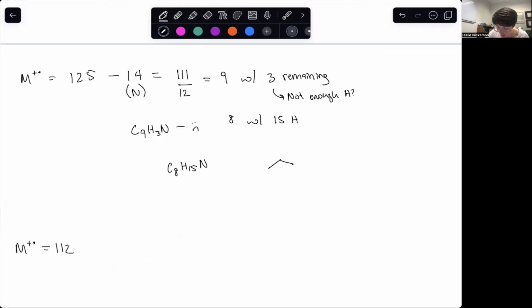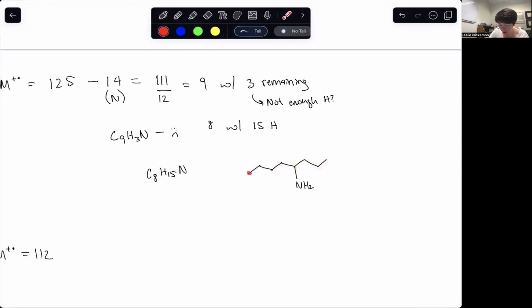So 1, 2, 3, 4, 5, 6, 7, 8. Okay, so I'm just going to count this out because I need to count up my hydrogens for myself here. So 2, 4, 6, 8, 10, 14, 17, 19.